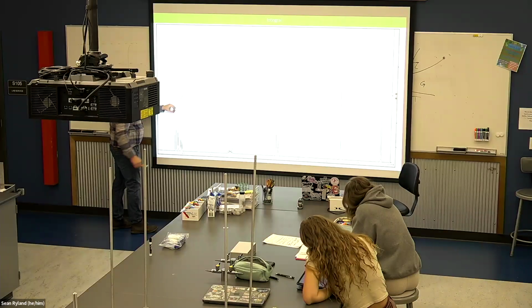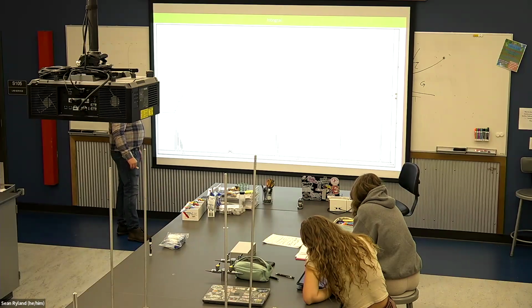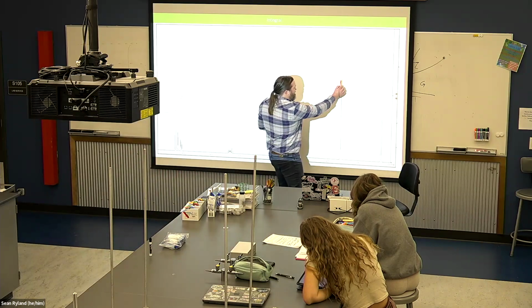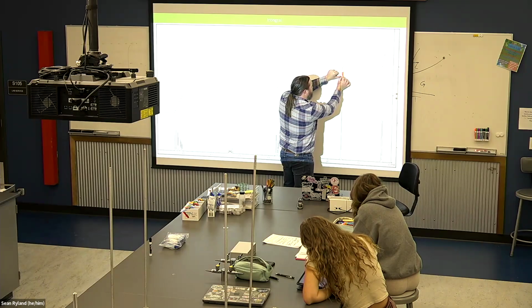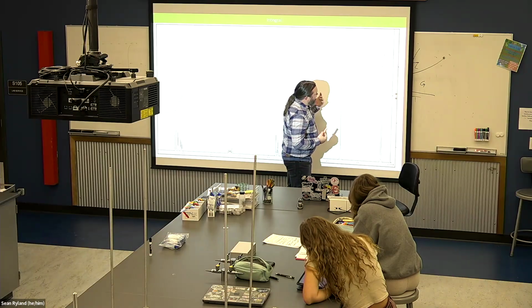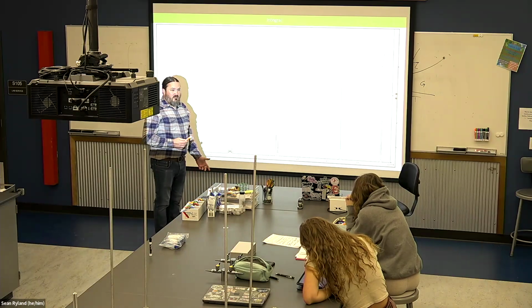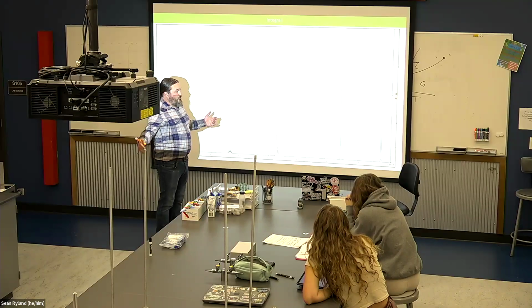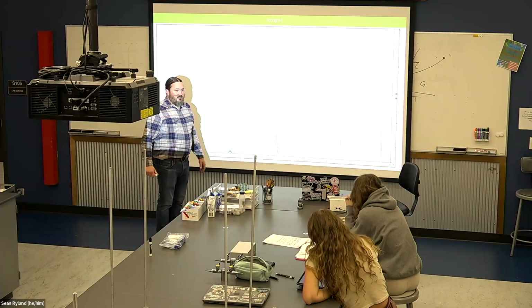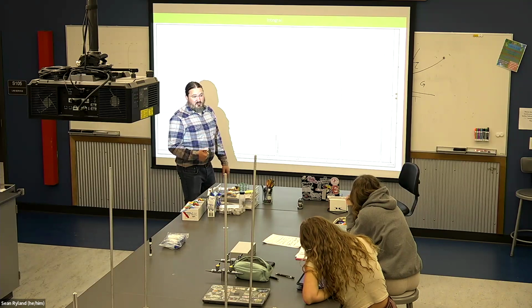1, 2, pretty close to 3, right? So you can say, okay, that's a 1, that's 3, that's 2. Is this closer to 2 or is this closer to 3? Or does it mean we need to multiply everything by an integer, like 2? That's when having the formula becomes really important, right? Because if you know there's a total of 13 protons, you just need to make sure that whatever numbers you assign for each of the integrals add up to 13 at the end.